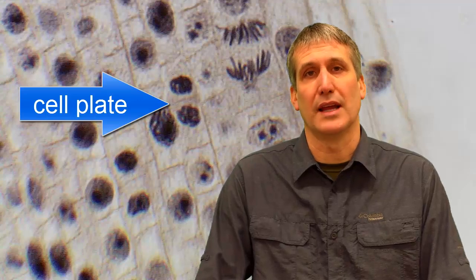Also look for cytokinesis. These are plant cells and in telophase particularly you can see the beginning of a cell plate forming between the two groups of chromosomes at either end of the cell.